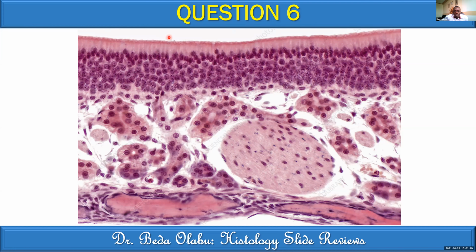Yes, I just have a little word with the answer. I think we agreed it was pseudostratified columnar epithelium with cilia without goblet cells. True. Yes. Okay. My question is, if you don't include the without goblet cells, is it wrong?